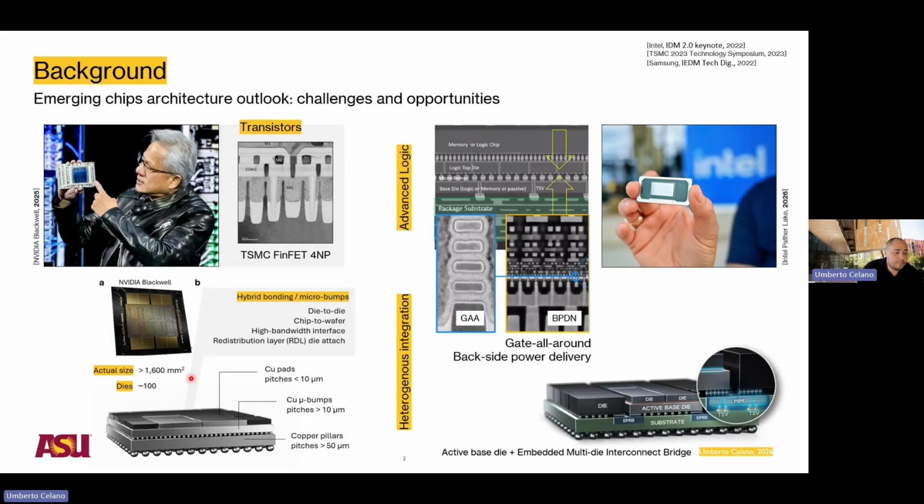And finally, never like before, we have this incredible amount of dies and field of view required to be probed. So in other words, it's really for the first time in history, you have to provide a metrology platform that goes from millimeter square down to single-digit nanometer square, possibly in the same tool, possibly at the same time offering correlative metrology solutions. So we do see that as a very exciting opportunity also to do a lot of research. And to some extent, my group does exactly that.